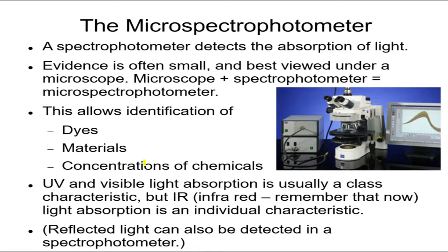And if you have your samples, let's say a concentration, it's a solution, you can identify what's in that solution using this microspectrophotometer. Because again, solutions will absorb certain amounts of light at certain frequencies. You can tell what is in there based on what it absorbs and what it does not absorb.